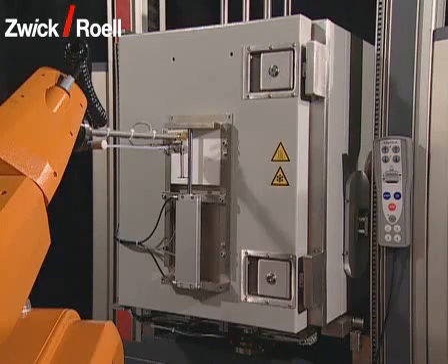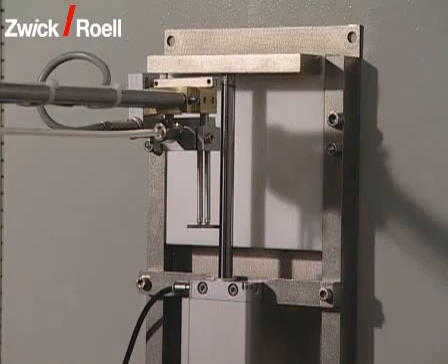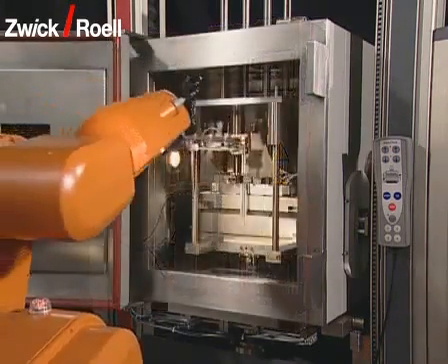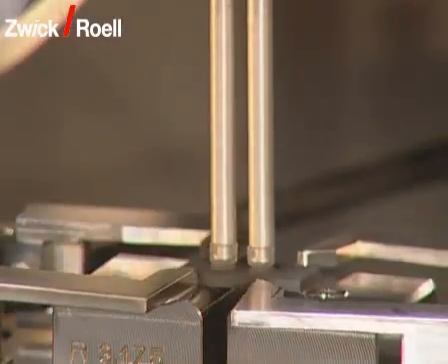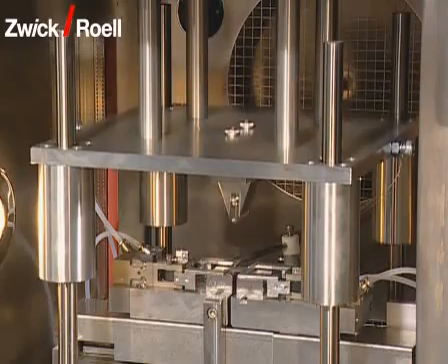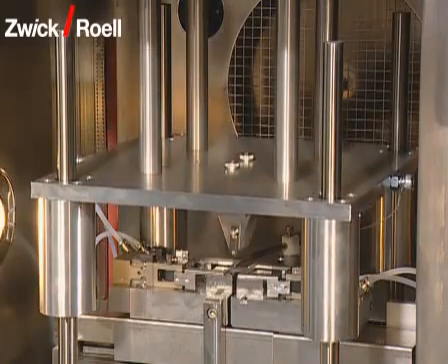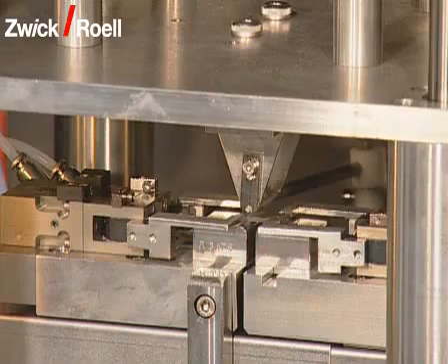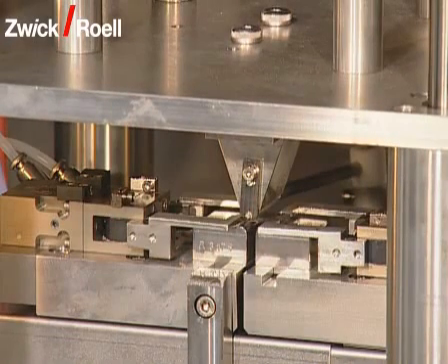Once the required temperature in the chamber has been reached, the specimen is transported to the testing machine and is introduced into the temperature chamber via a door. There, the specimen is put on the bending table and exactly centered. Now, the test starts. With an additional pillar guide, the bending punch is driven on the specimen with high precision.